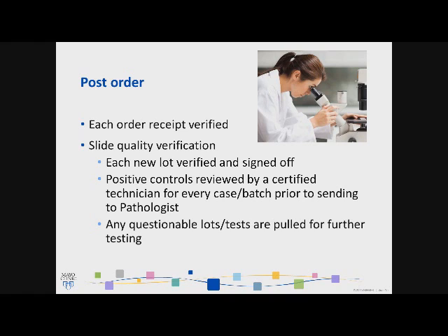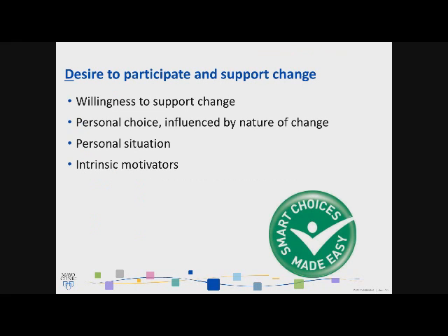If for some reason that test has been pulled for an extended period of time, we send all those tests up to our sister institution, Mayo Rochester. However, that does affect turnaround time, so we try to get those taken care of and turned around as quickly as possible. Very quickly, I think I've gone through a couple things that we do to try to assure quality.